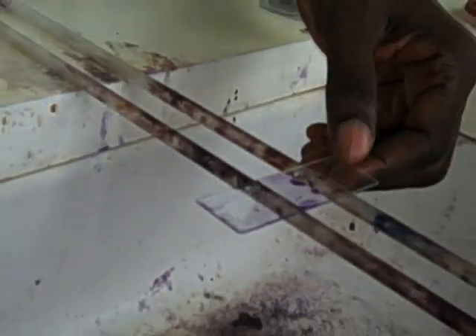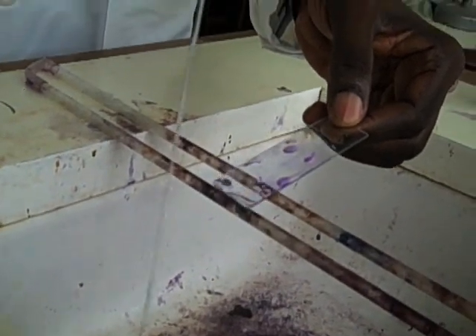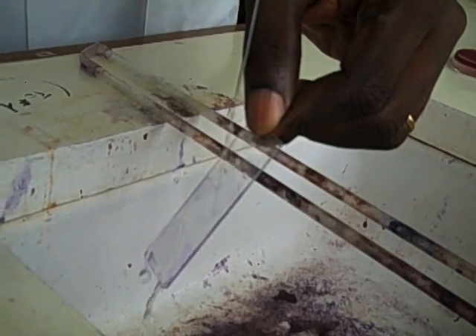Decolorize the smear with acetone for 10 seconds. Tip off the excess alcohol and wash under gentle tap water to remove the excess decolorizer.